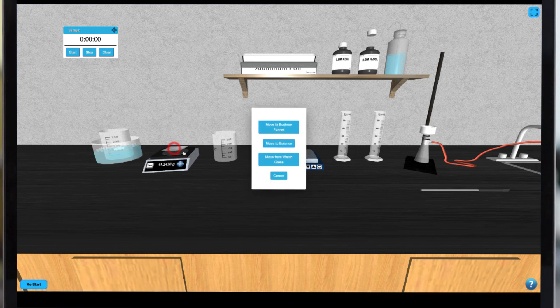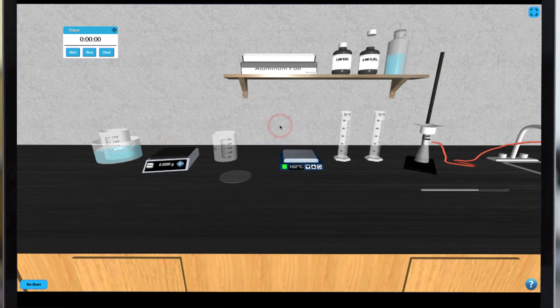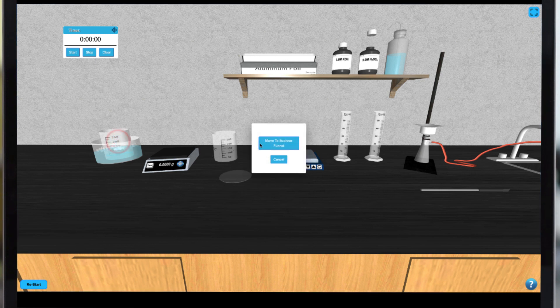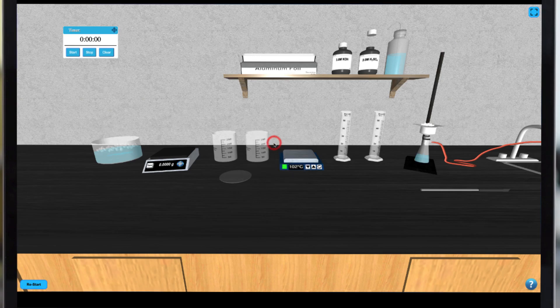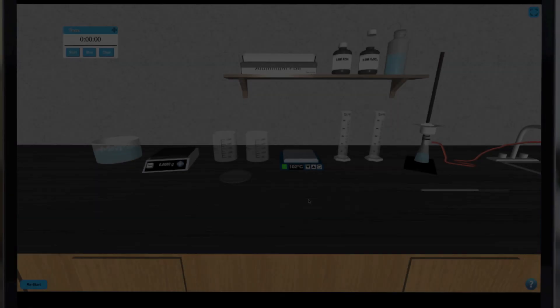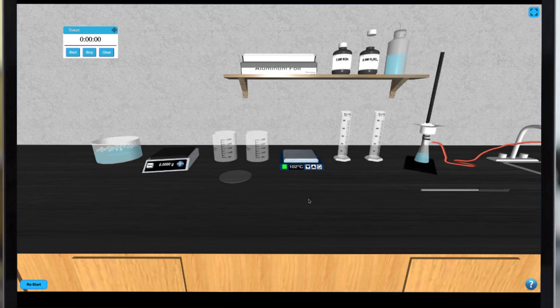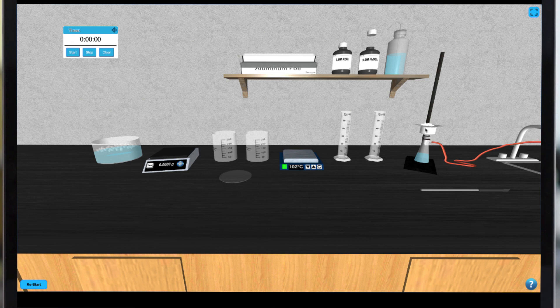Then you can place your sample on the filter paper by clicking on the beaker in the ice bath. This will initiate the filtration process which will take about two minutes. Once complete you can move the filter paper containing your crystals to the watch glass and weigh them again to obtain your final mass.